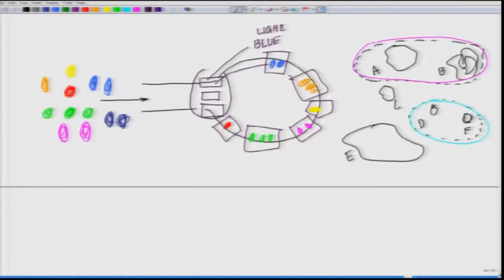They will tell you, okay, your sitting spot is here, or yours is here, or here, wherever. Now, at the microscopic level, these sentries will be replaced by specific probes.